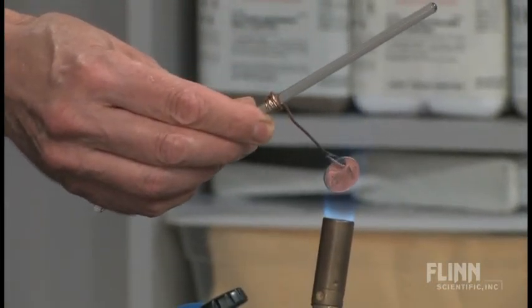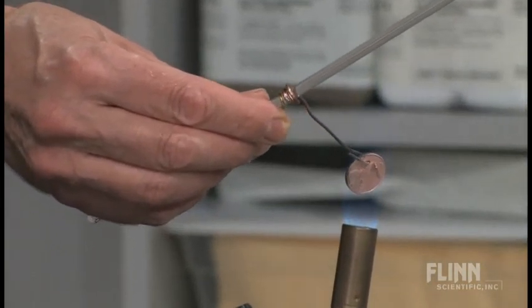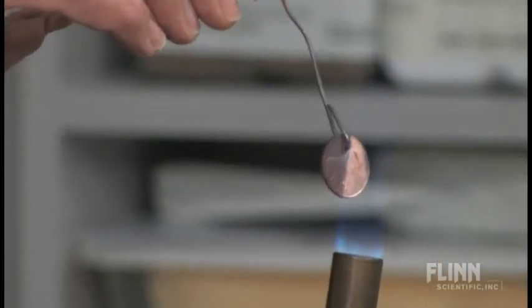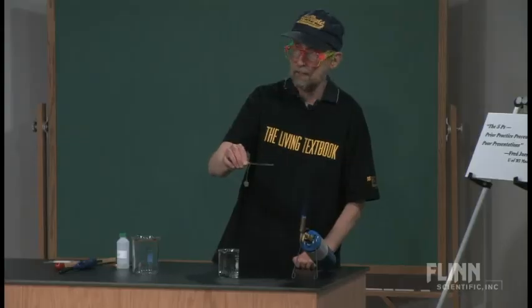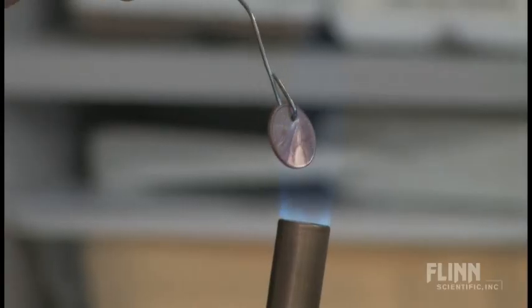By the way, you can't use new pennies because they're filled with zinc. You can try, but if you heat a new penny with a torch like this, it will melt. There it is — that penny is pretty darn hot. I think we're about ready, because I can't hold this wire much longer.